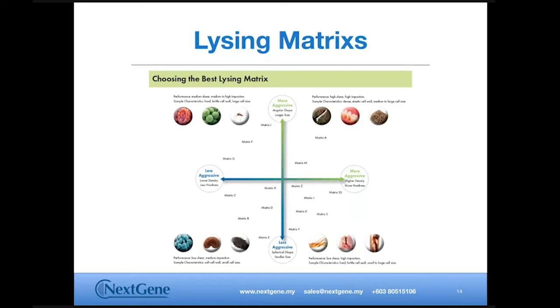So the proportion of the targeted organism is very important. If, let's say, the number of virus in the sample is low, the chance that we're able to sequence the virus instead of, let's say, the bacteria depends on the proportion. So that's why this one remains a very challenging thing.